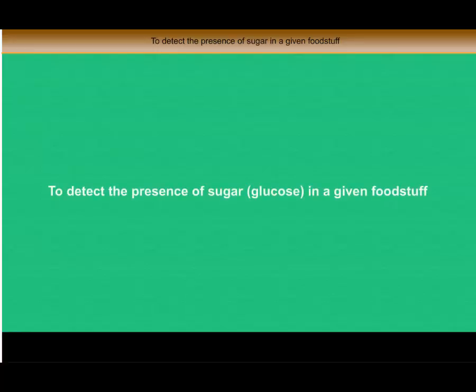To detect the presence of sugar in a given foodstuff. Things required: some content of the given foodstuff, a test tube, a Bunsen burner, and Benedict's solution.